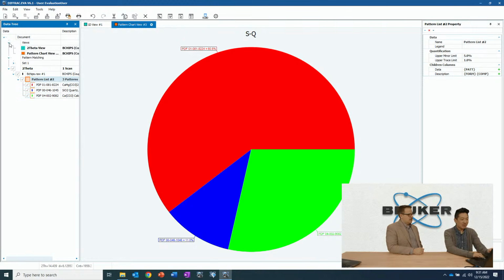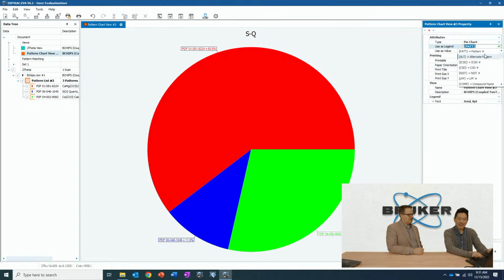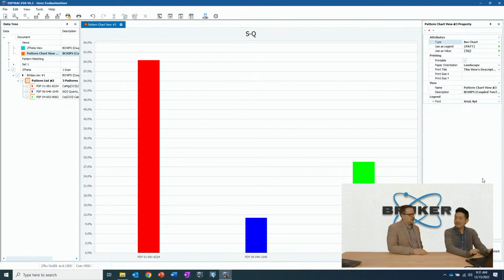I don't love pie charts. I prefer bar charts. So what's a bar chart look like? It looks like a bar, John. I don't know. Everybody's bars look different. So this is generally how I like to see my data. Yeah, there we go. And it's all right there.